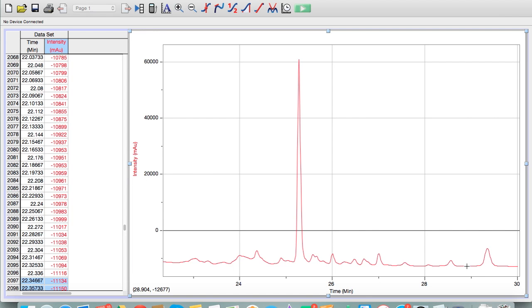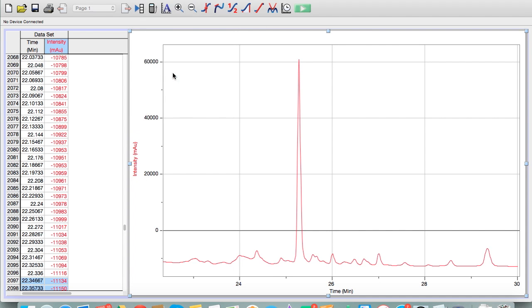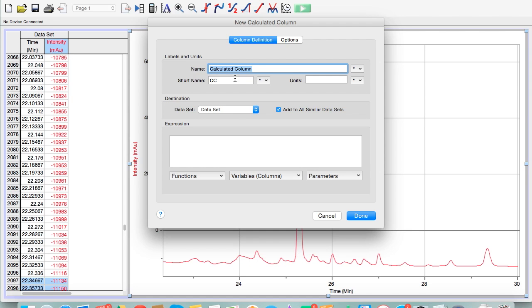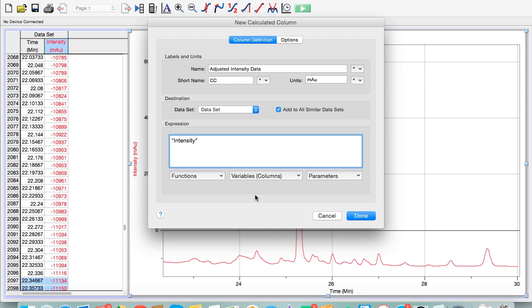So what I'm going to do is I'm going to create a new calculated data column. I'm going to add that in to the Y intensity data. Here's how we do it. We go to data, new calculated column. I'm going to call this adjusted intensity data. The units are going to be the same. What I'm going to do is take the intensity column, click on this intensity, and then to every value in that intensity column I want to add 12,677 to each value, and that's going to bring it up to the zero line.